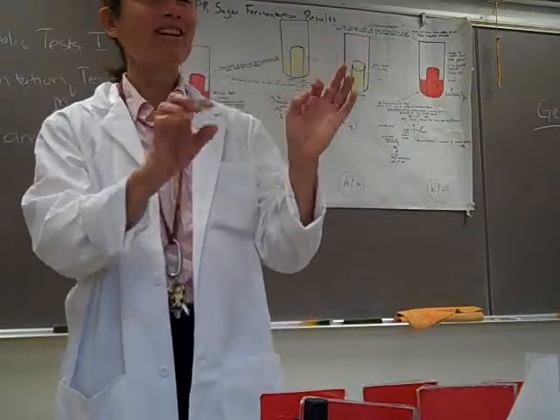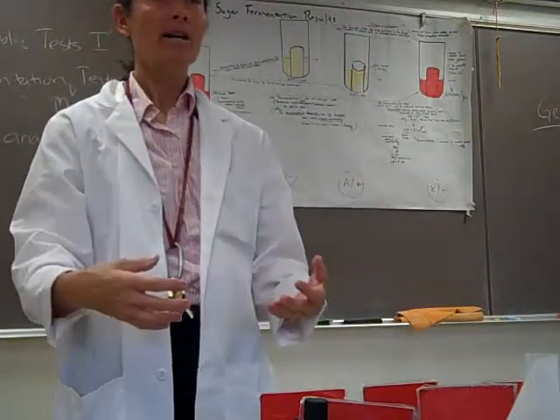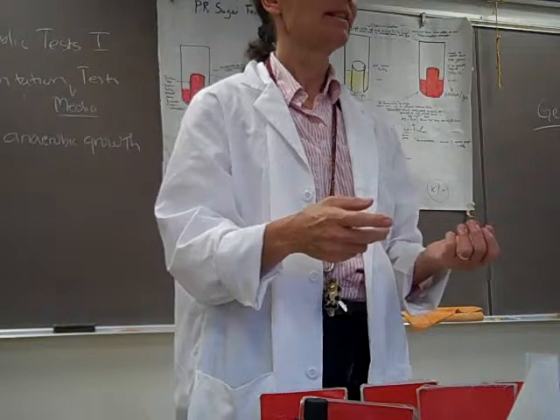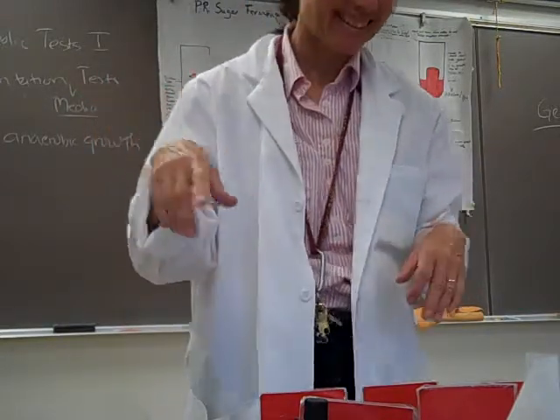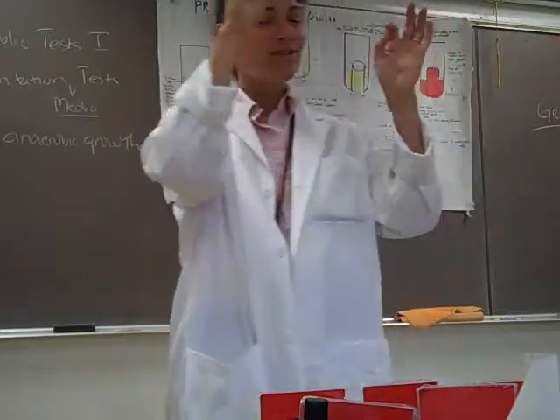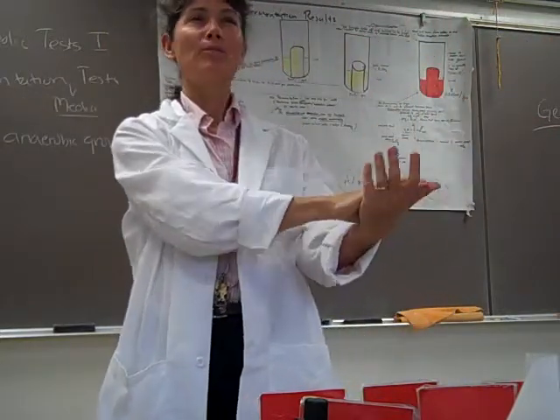And you want to make sure you make your tape labels before you come up, because if you grab the tubes and take them back to your bench, you're going to be sitting in the corner here, Francis. You want to make sure that you put the tape labels on the appropriate tube.